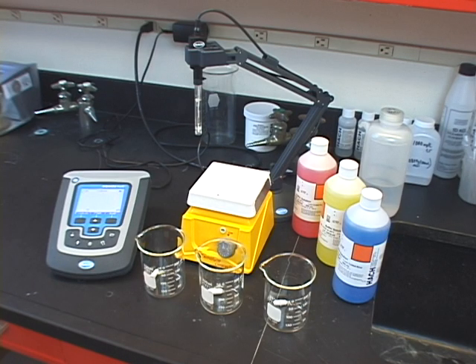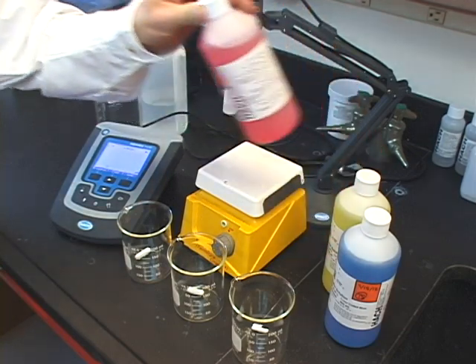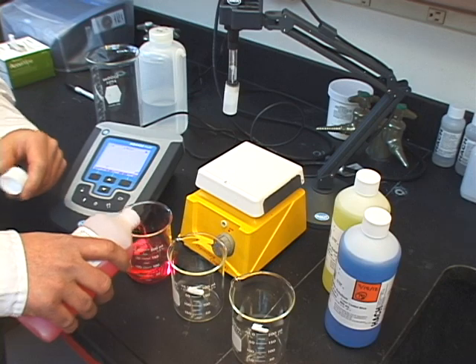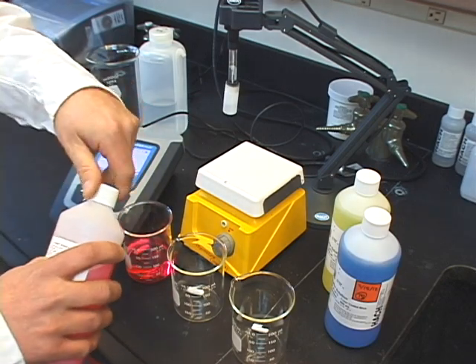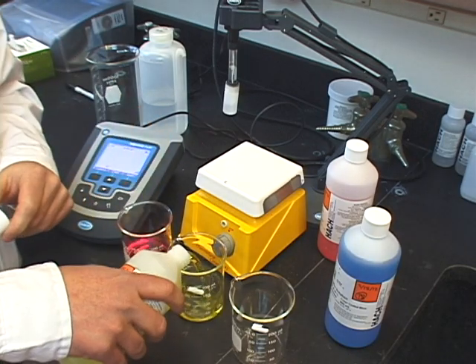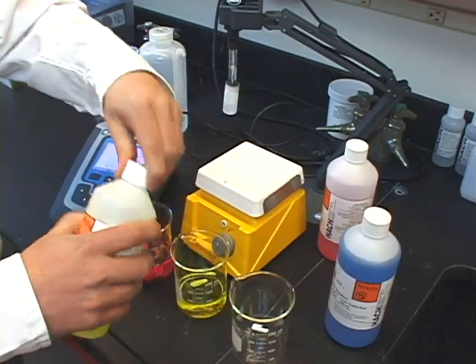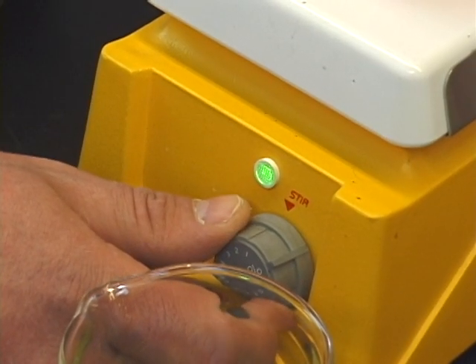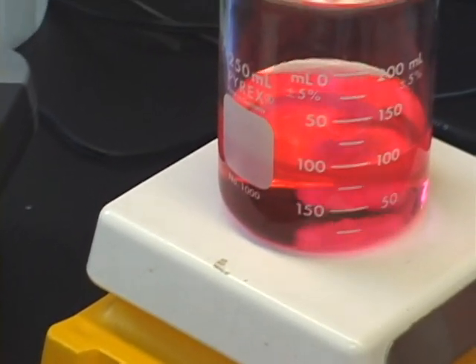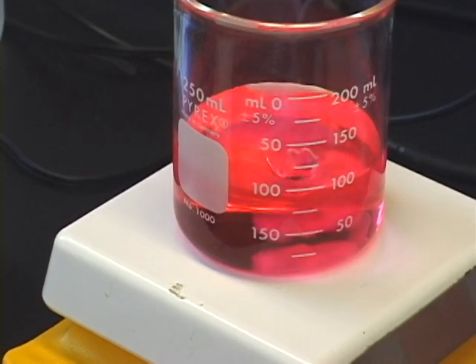Now we're ready to calibrate our meter. When calibrating, it's essential that you have enough buffer to immerse not only the bulb, but also the electrode junction. The more buffer you have, the less chance you have of introducing contamination. Start by pouring the buffers required to bracket your expected pH result, as we discussed earlier. Next, adjust your stir rate to a slow to moderate setting. Using a stir ensures the highest level of accuracy when taking pH measurements and also helps with response time.